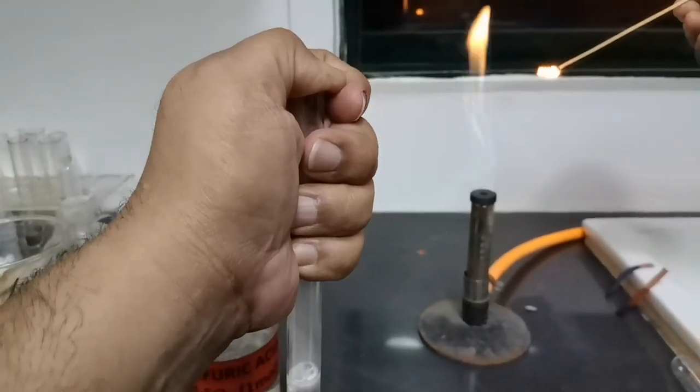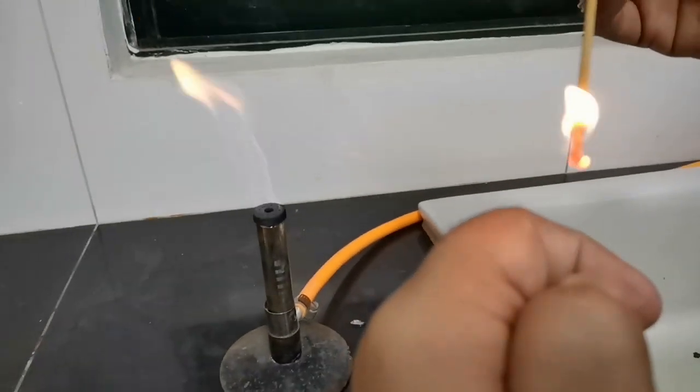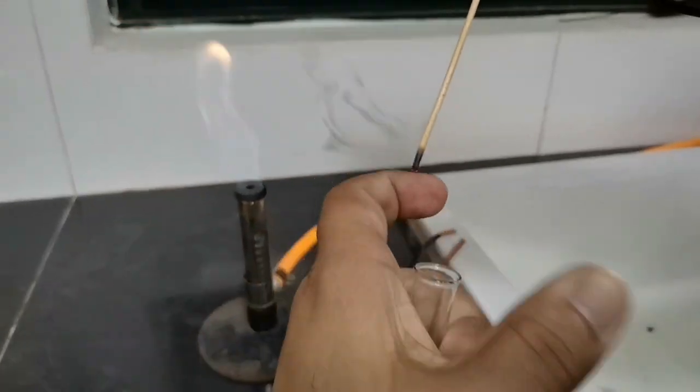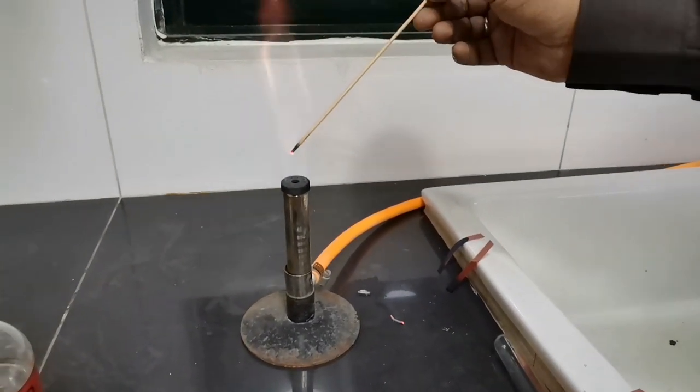Now let's test for the gas. Here we have a burning splinter — we are going to release the hydrogen gas onto the burning splinter and see what happens. Let's do it again; we did not hear the pop sound on the first go.